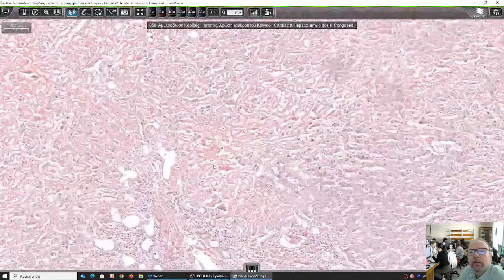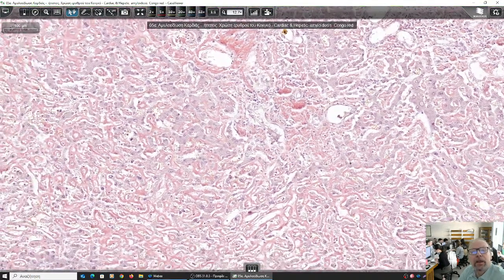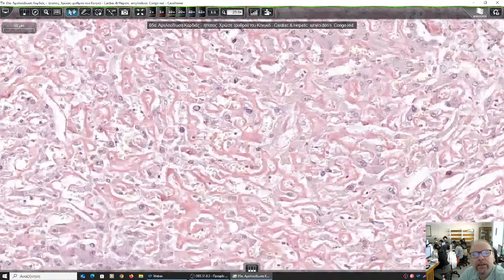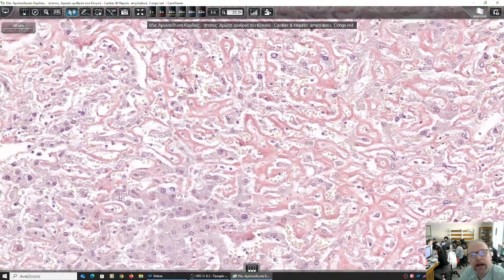Here, what can this be? Here, this is the liver. So the other was the heart. You see these trabeculae of liver cells? Didn't we say that amyloid starts being deposited under the endothelium? Which is the blood system here in the liver parenchyma? The sinusoids. So have a look how nicely the sinusoids are highlighted due to amyloid deposition. You see? And probably some of these cells along the sinusoids are Kupffer cells.